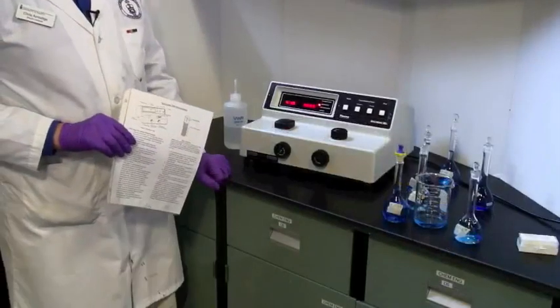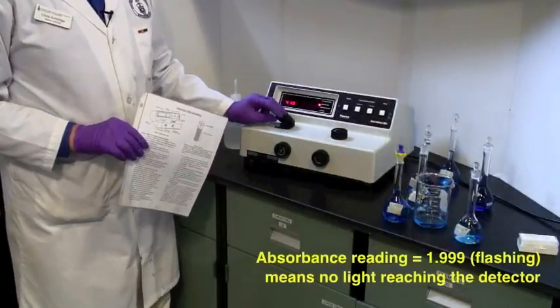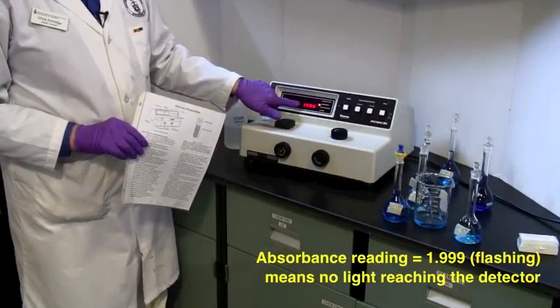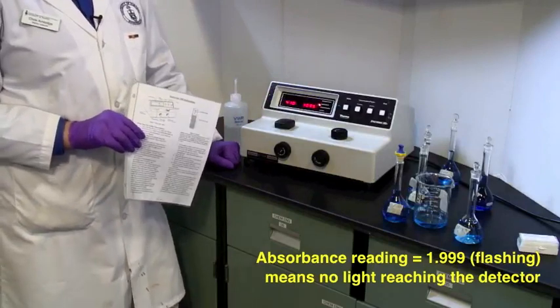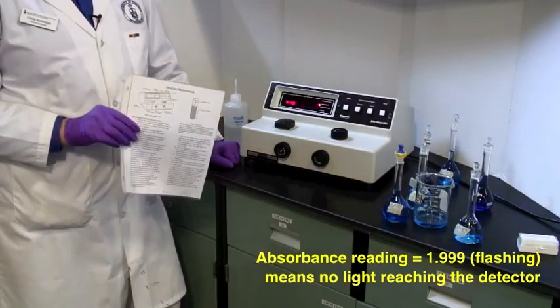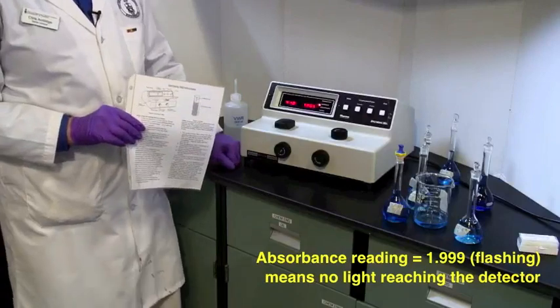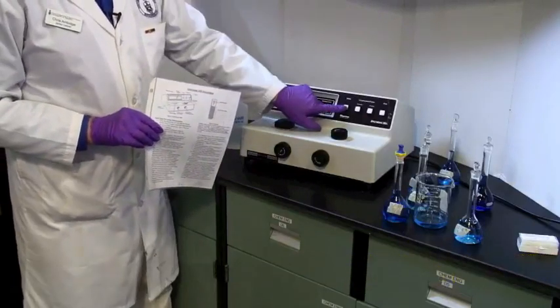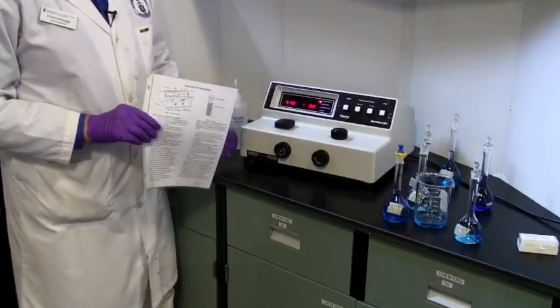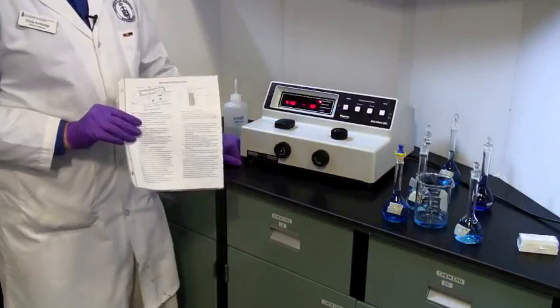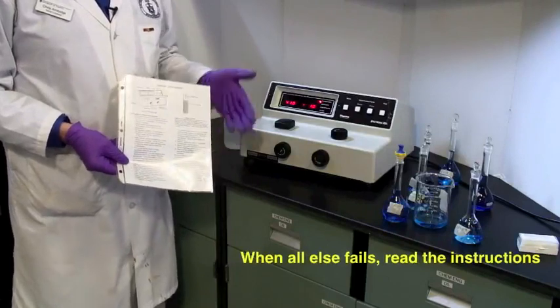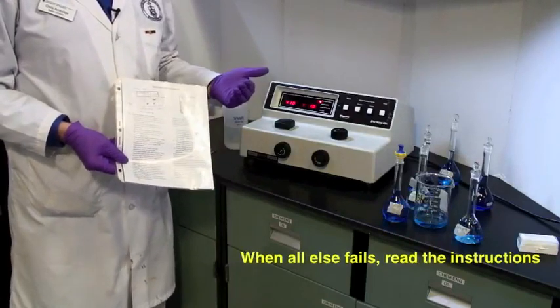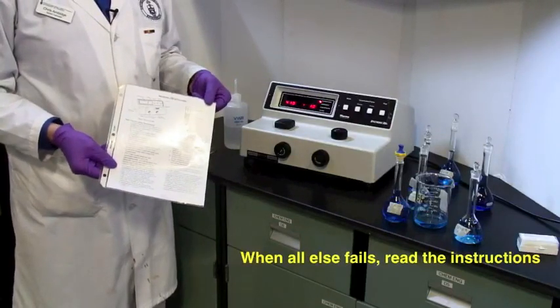A few last pieces of information. When there is nothing in the sample compartment, and there's a shutter across there, if you're in absorbance mode, it flashes 1999. That's as close as it can get to 2. And the flashing means, I'm not seeing any light. Now, that's all that that number means. If you turn the percent transmittance, you get an unstable number. The other thing to point out is, we have printed instructions. When all else fails, read the instructions. If you can't remember what I've said, this will always be available to you.